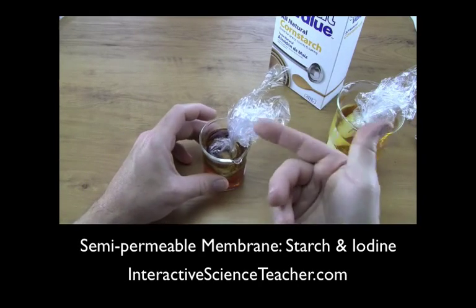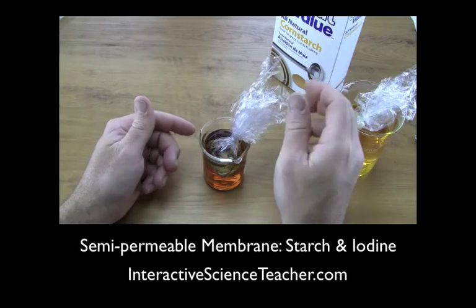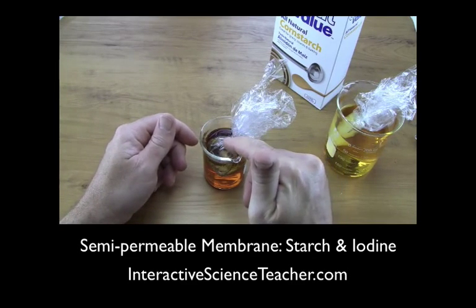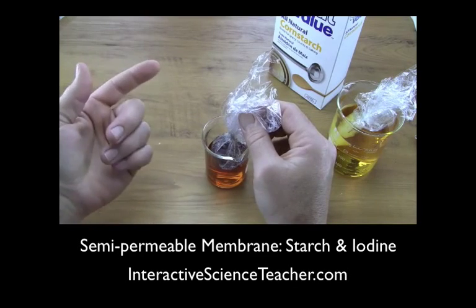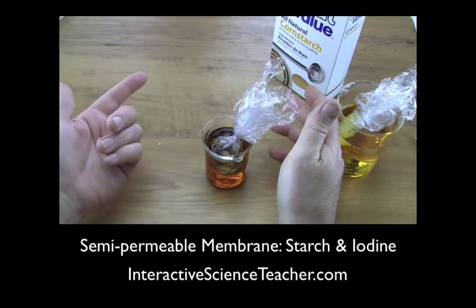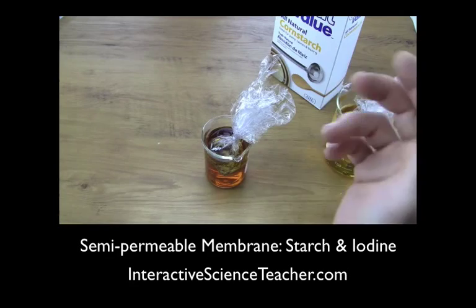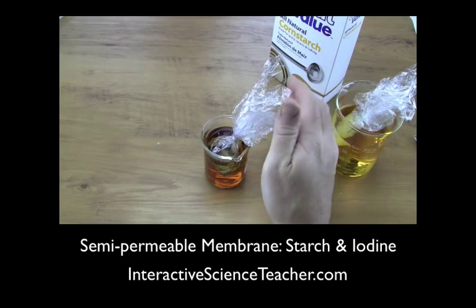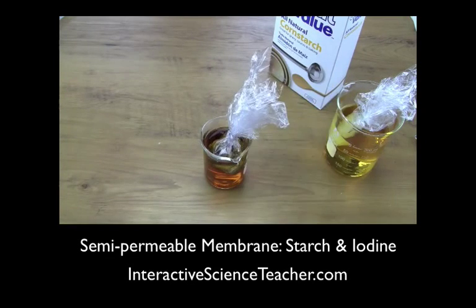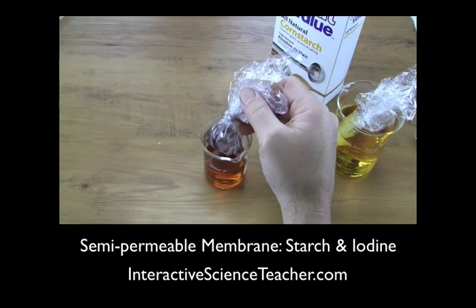You can also switch the setup and put iodine on the inside and the starch solution on the outside. I'd do day one normally — iodine outside, starch inside — then tell students that tomorrow we're going to switch them. On day two, I have a beaker under a towel and have the kids predict. They'll assume the water on the outside is going to be black, just like day one when it mixed on the inside, and that the inside will be clear or maybe a little golden.